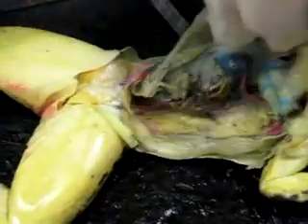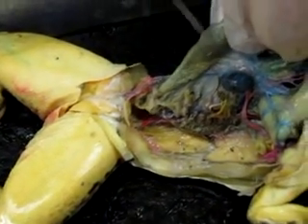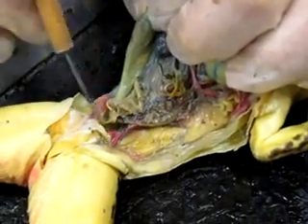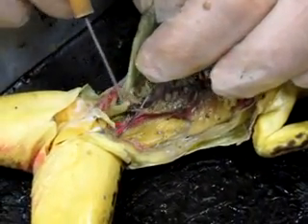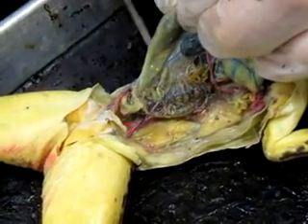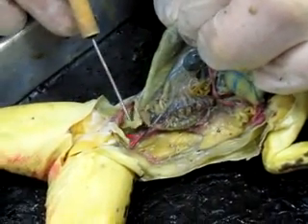The ileum then empties into the large intestines, or colon, here. This is my large intestines, which will empty into my cloaca back here, is the cloaca, and here is the urinary bladder. Remember, we have urine, solid waste, sperm, and egg all empty into the cloaca.